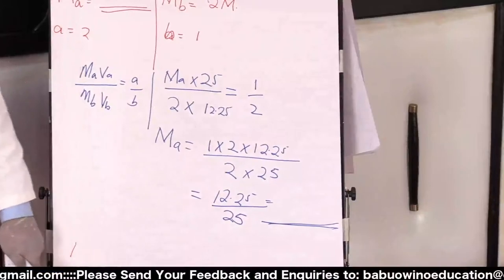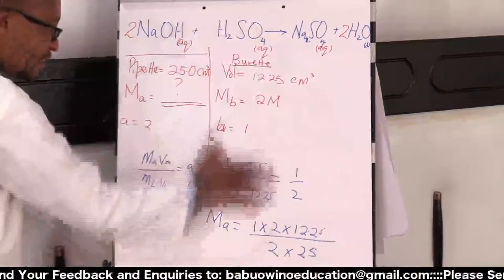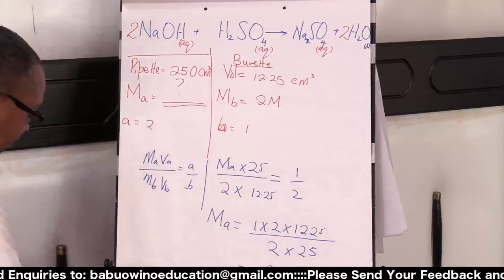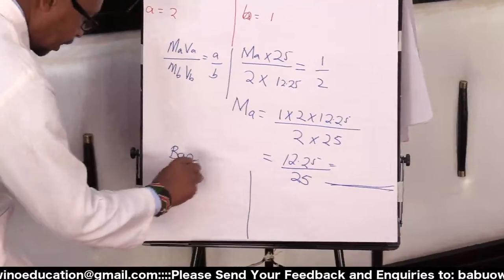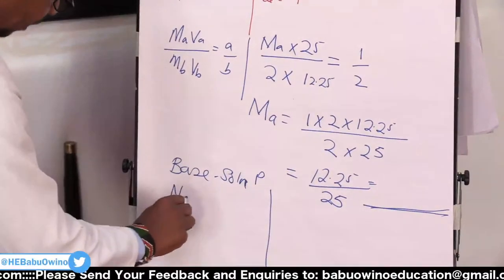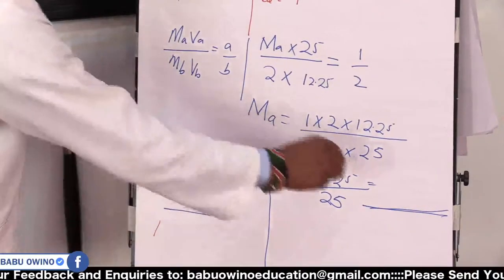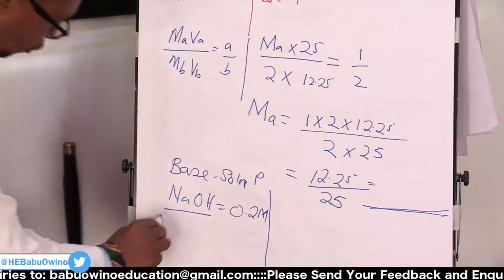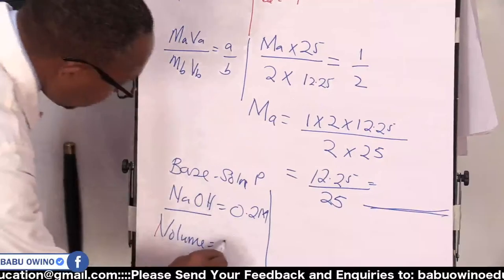Now, next in our course here is that you can be asked very many things by the examiner. The exercise remains the same. The examiner may choose not to give you the acid. So the examiner may tell you, you are reacting a base. And this is solution P, which is sodium hydroxide, and whose molarity is given, say here 0.2 molar. And the volume you know from the pipette, I mean, from the pipette is 25.